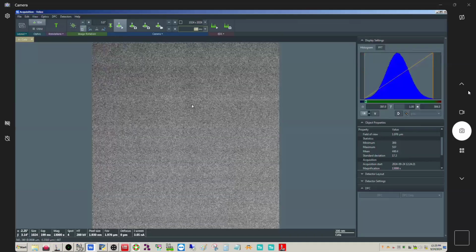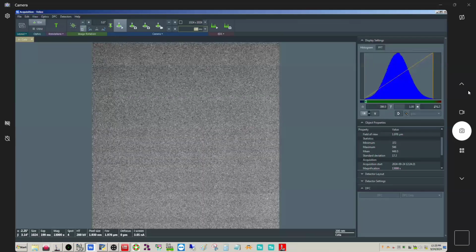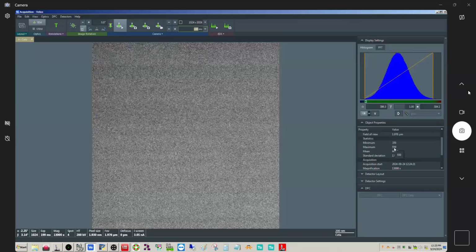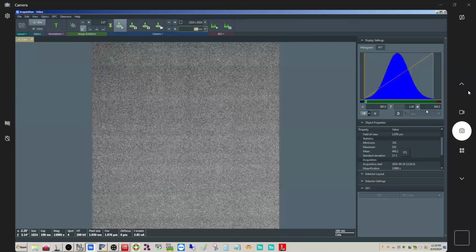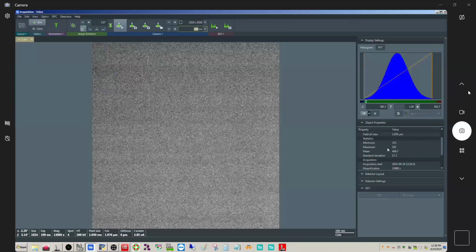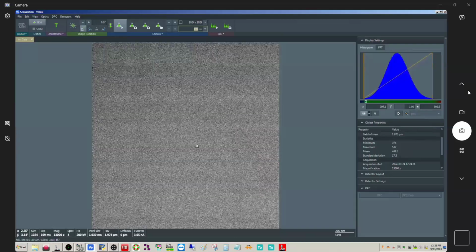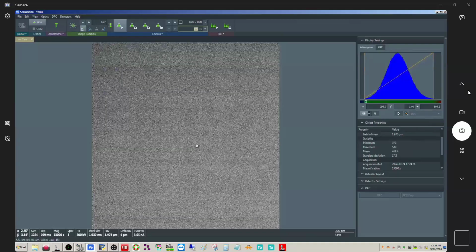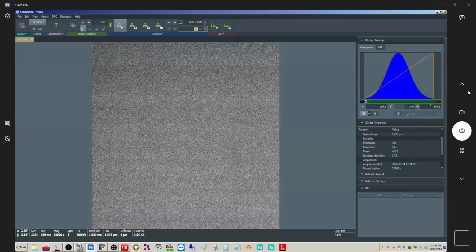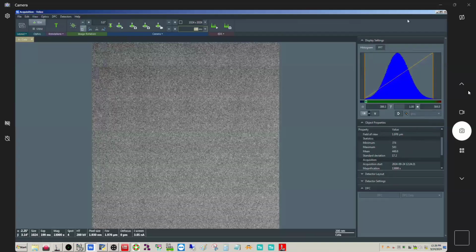But anyways, you can see this number is not the same as this, okay? So this is actually noticeably higher than this. Now, it's not a whole lot higher. That's only about, I don't know, like a 5% increase. But it's still noticeably higher. With a diffraction pattern, though, this discrepancy is going to be huge. Okay, so let me go back and let me stop this here.